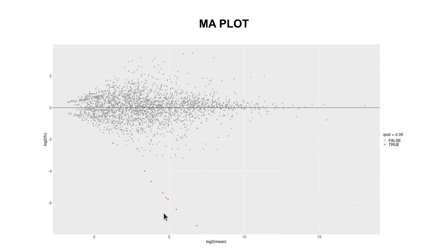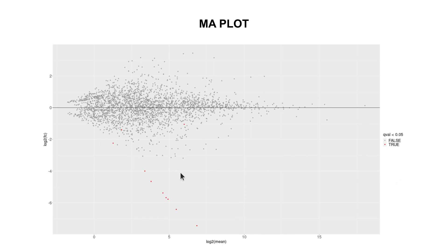With MA plots, the up-regulated and down-regulated genes are at the extremes. The upper region contains up-regulated transcripts and the lower region contains down-regulated transcripts; the middle has those not differentially expressed. Looking at the data here, all the transcripts appear in the lower region, which means these are down-regulated transcripts.